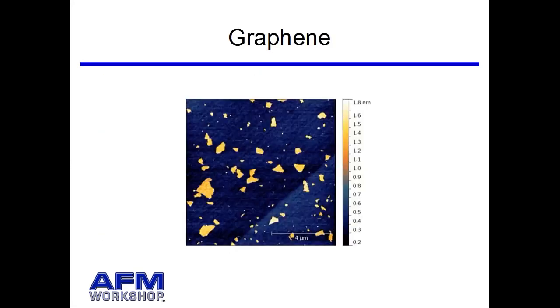I just want to point out something on this image. With an AFM, you're using what's called false color. So I made this a blue background with a nice gold layer. We could make it a white background with black to make it represent more what people think graphene looks like. But the color scale is like an artificial rendering, which is available to atomic force microscopes.